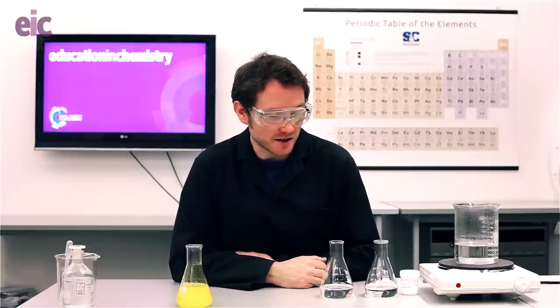In this demonstration we're going to be precipitating lead iodide out from a mixture of two solutions: lead nitrate and potassium iodide. This is a demo you'll likely have done before to produce a cloudy yellow precipitate, but with a little bit of care and attention taken with the concentrations you can produce some really beautiful effects.